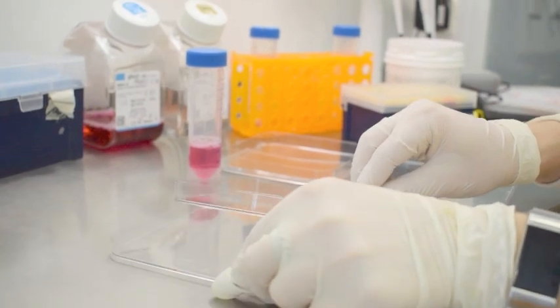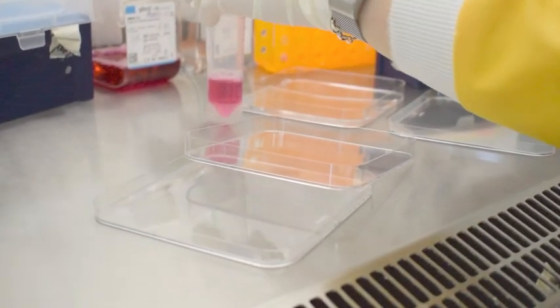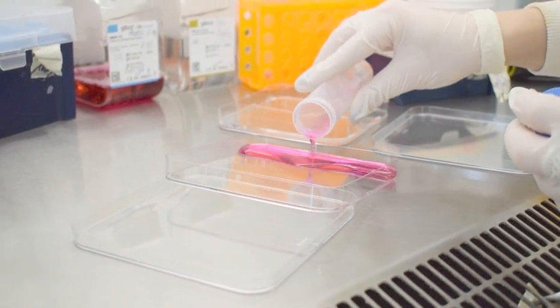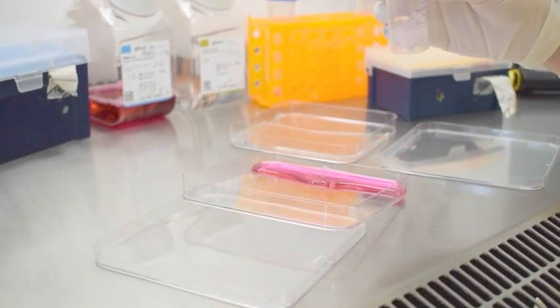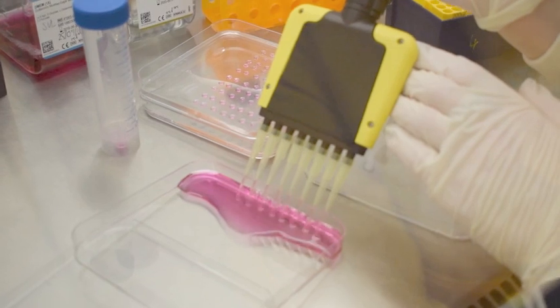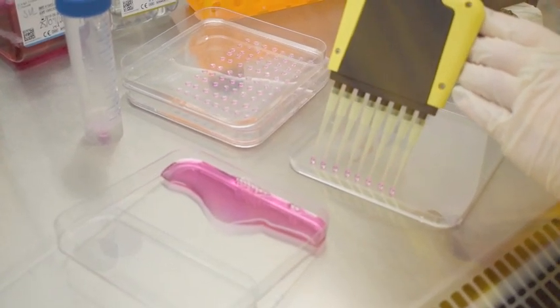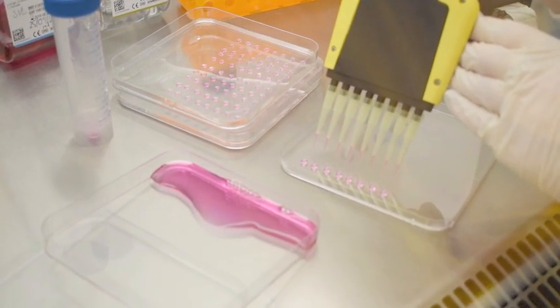Using an additional petri dish, add the cell suspension to a slightly angled lid. Using a multi-channel pipette, pipette 20 µl of the cell suspension onto the top lid of the square petri dish.